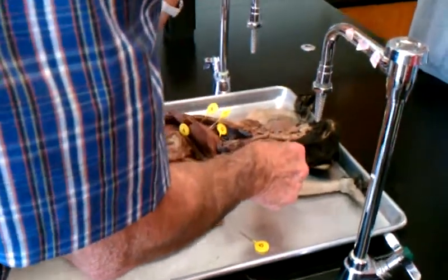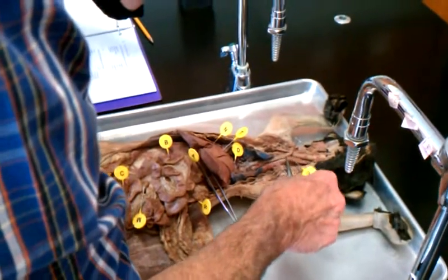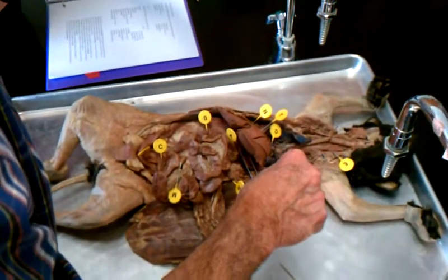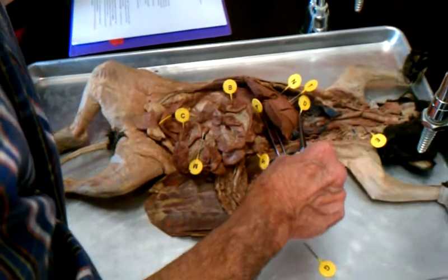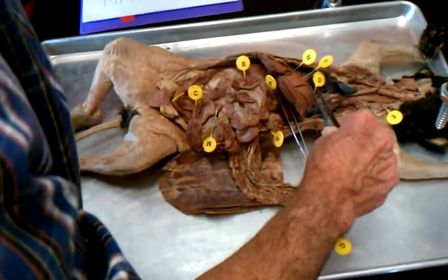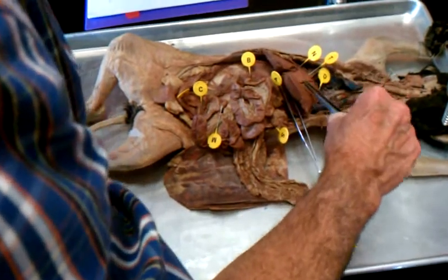So that tube that runs behind the pharynx, behind the trachea, that's the esophagus. The esophagus comes on down, goes behind the heart, goes through the diaphragm, so deep, the pin stuck in the diaphragm. Just beneath the diaphragm is the liver, and in the cat the liver is just huge, and you can see it here, and there's lobes of the liver separated by these crevices.